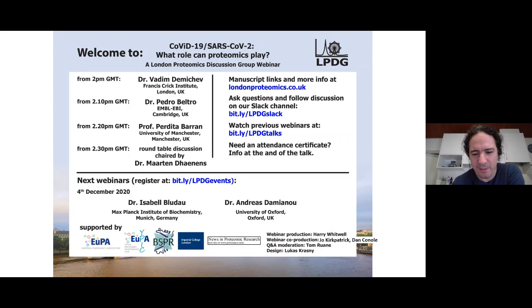I think a lot of what was done could have been done 5 years ago, maybe not with as sensitive readouts, but the types of analysis that have generated quite a lot of advances are not necessarily the most cutting edge stuff currently done in mass spectrometry. It's really just that these are practical, useful ways of understanding cell biology and how it changes, which suggests drug targets. In fact, single cell sequencing or these types of approaches are not very good at doing that. They've been good at understanding the immune response, for example, which is something that's been done better at the single cell level. But these approaches are very good at understanding the biochemistry and the cell biology. And that's what gets you the targets.